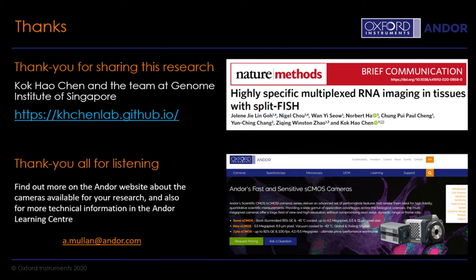Yeah, I think it will, in the sense that it might further improve the signal to noise. It can, for example, reduce noise associated with autofluorescence, like from protein or lipid, because these split FISH approaches focus on optimizing, or rather increasing, the specificity of the probe, right?